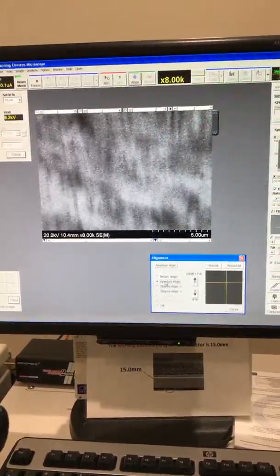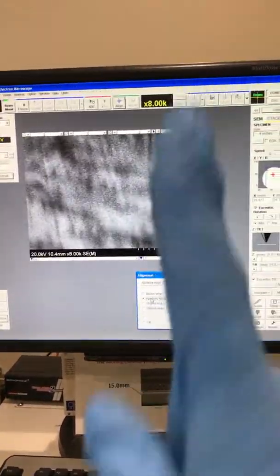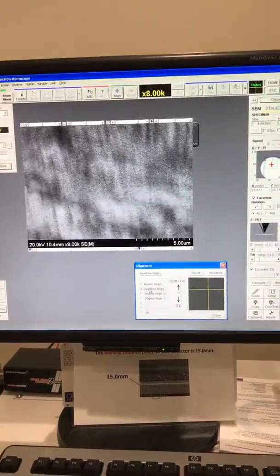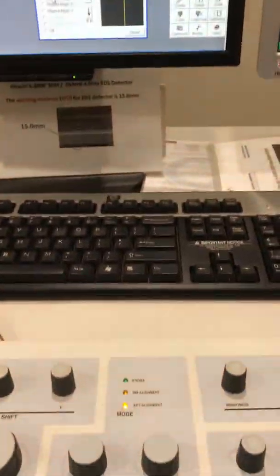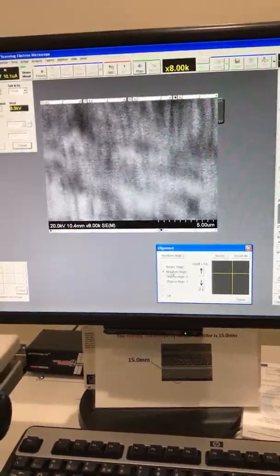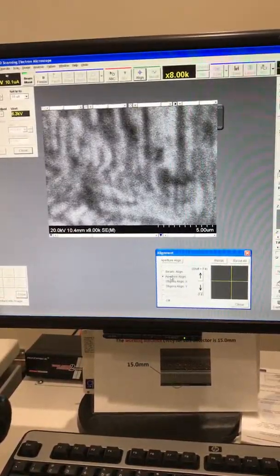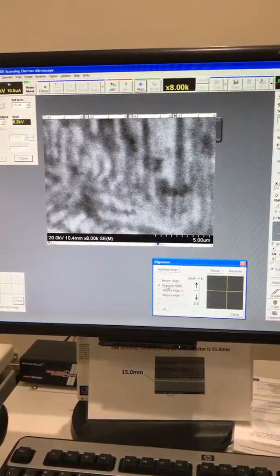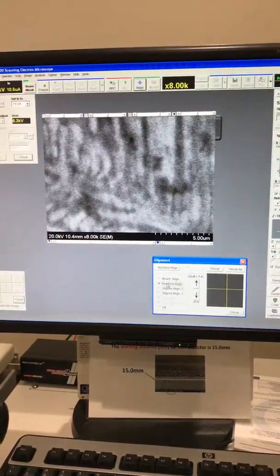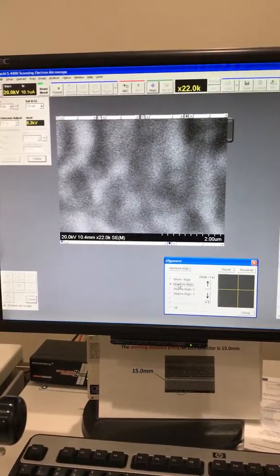By turning X, I can see it's going in the zigzag direction. Now it's time to use the other knob, so I turn the other knob. Now it's going in and out and there's no movement — that means the microscope is aligned.